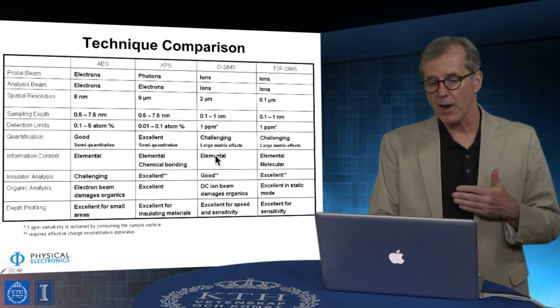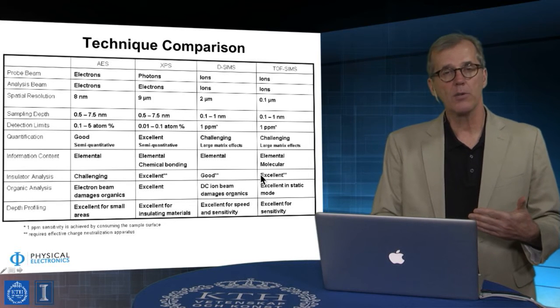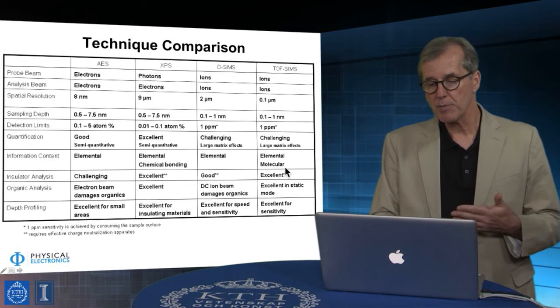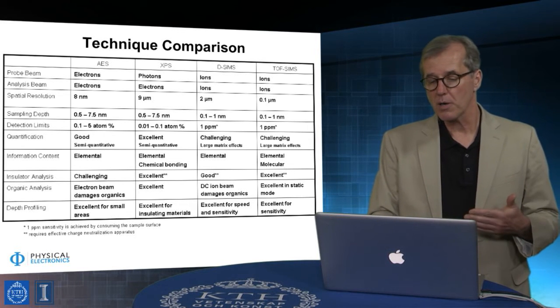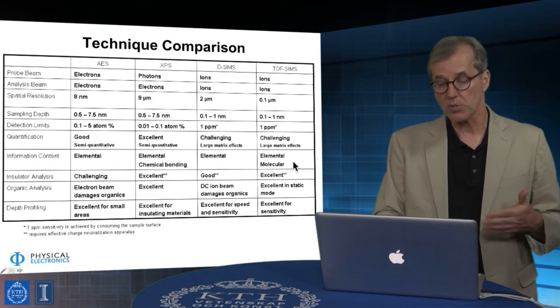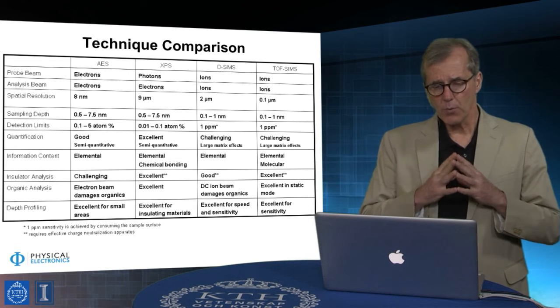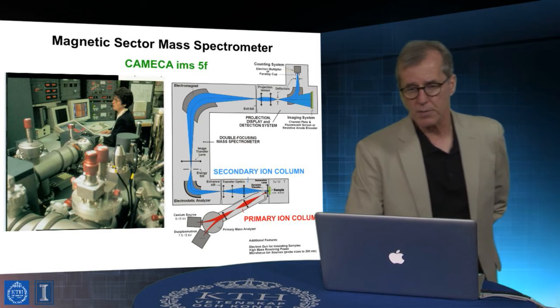So it's very good for elemental specificity, but it loses any kind of useful attribute related to the molecular structures that might have been present. Whereas static SIMS measurements, time of flight SIMS being a stand-in for that, is much more useful for looking at molecular attributes associated with material systems. And so with this, we see there are nice complementary characteristics of these two spectroscopies.